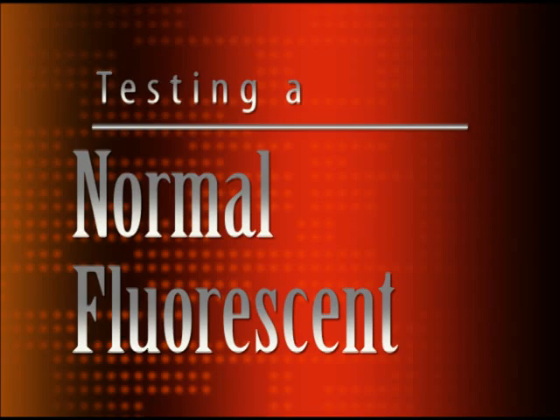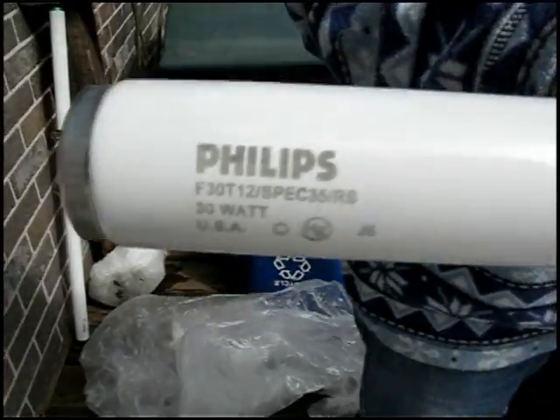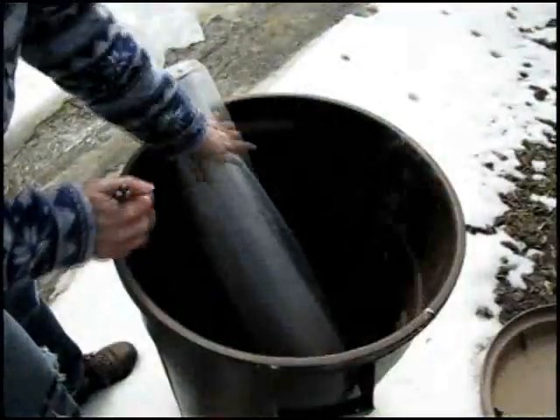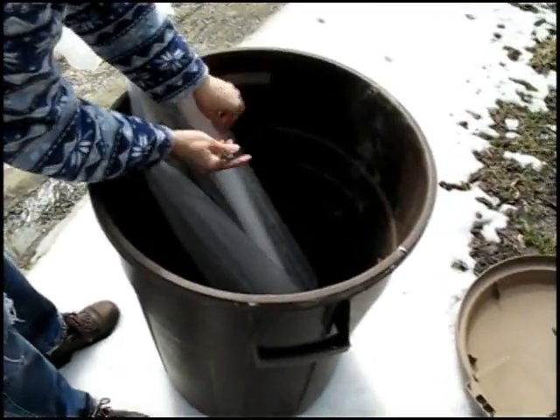First, we tested a normal fluorescent light bulb that we purchased at Home Depot, a Philips F30. We sealed the bulb in a thin cellophane bag and placed the bag containing the bulb in a conventional plastic trash container. We poked a small hole in the bag just large enough to fit the wand of the mercury analyzer through.